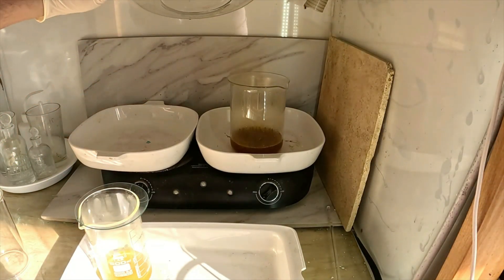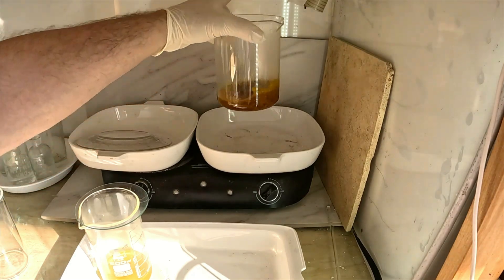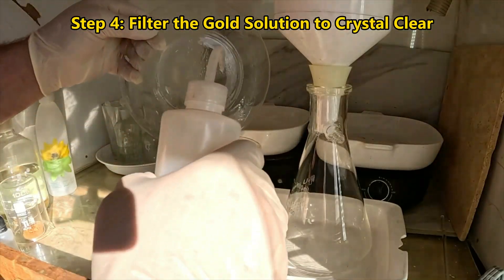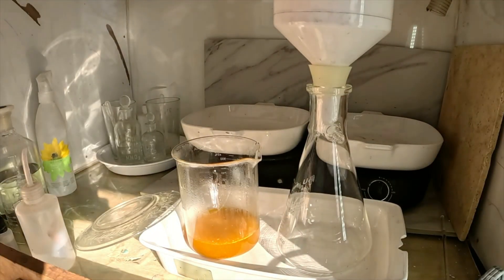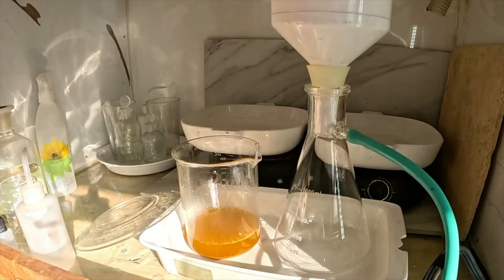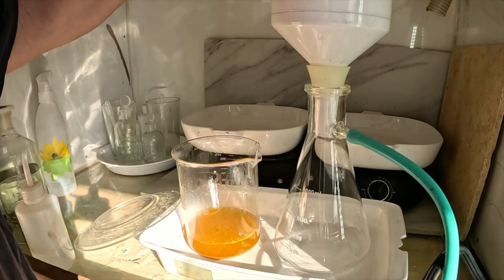It took about 10 minutes to dissolve those gold foils, but before we see any actual gold, we're going to need to filter out any contaminants still in the solution. Multiple rounds of filtering through the same filter are going to get us to a crystal-clear solution and set the stage for pure gold recovery. We'll get our filter set up, get the filter paper into the funnel, wet it down to get the seal, and we're off to the races.